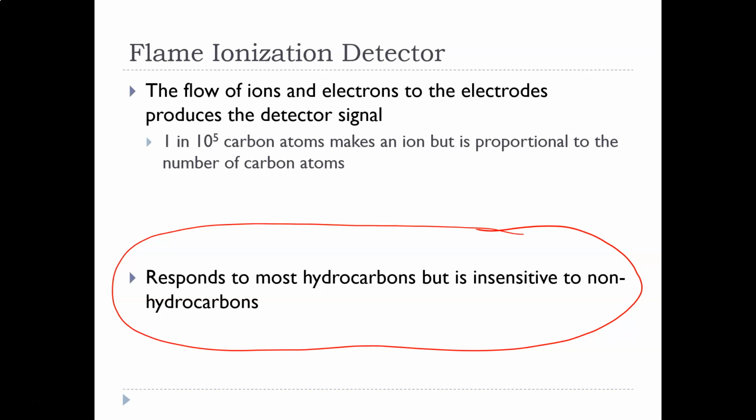That is the detector in our gas chromatography instrument at St. Charles Community College. Our newest, we have 2 of them actually. Our new gas chromatography instrument was real clever, and the detector is actually something you can remove. So we could buy multiple detectors, and I can put in the FID when we have hydrocarbons, and I could take it out and put in a different detector when I'm testing a different sample. We have that opportunity, but we currently only own the FID. But we're going to look at some other detectors.